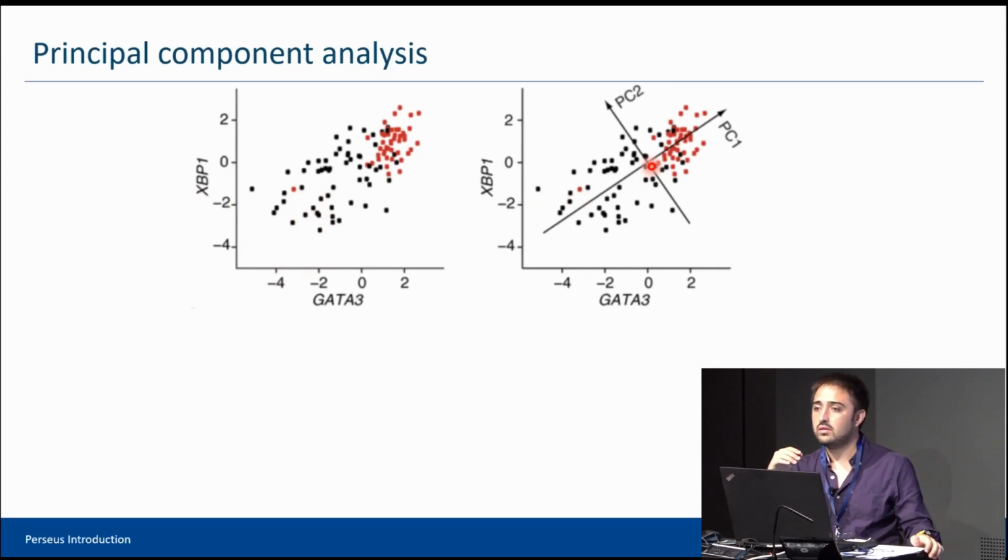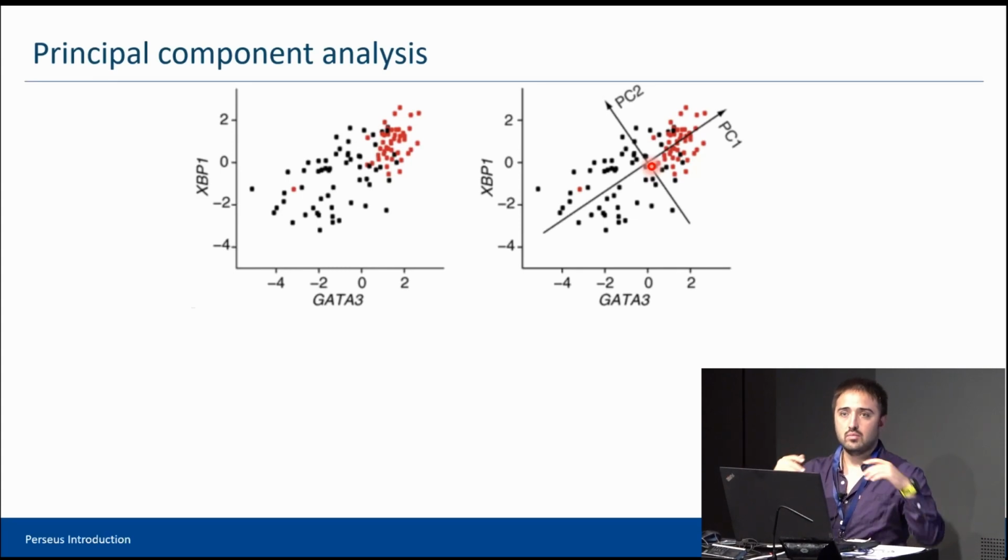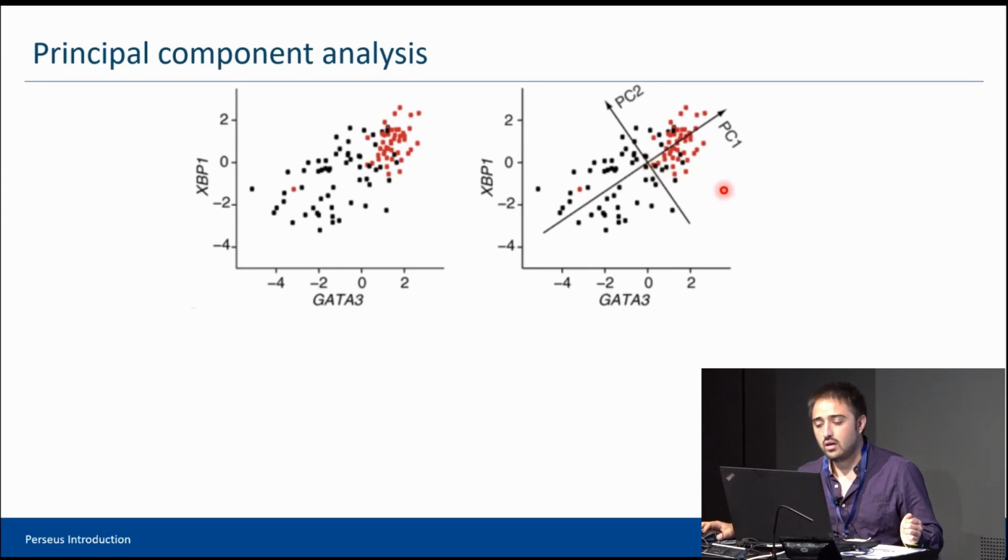Are you going to say? Just maybe, should we call it ellipsoidal, because it's not the same. Oh yeah, exactly. I guess you can also make it circular, but I think the standard procedure in PCA is that you would leave it with different radii in the different directions. Yeah, you're right. Sorry, thank you. Sometimes people normalize it, but in proteomics it's really like that, exactly as Jürgen said, because you are actually losing a lot of information if you change the proportion of the length.